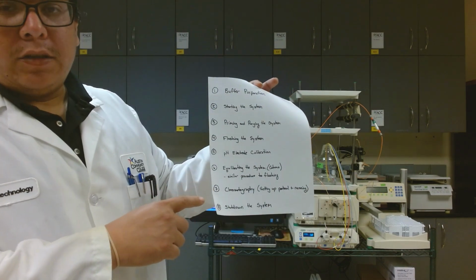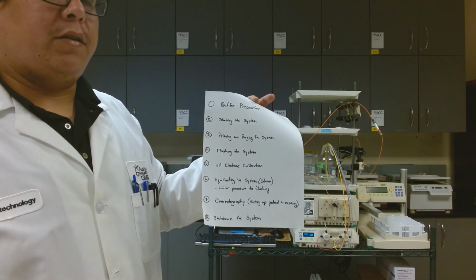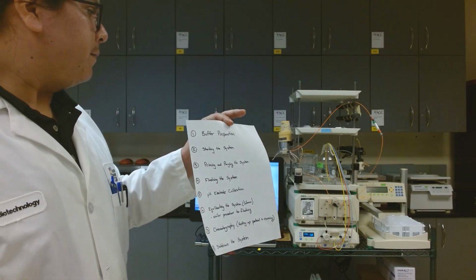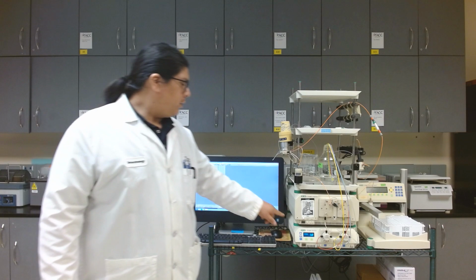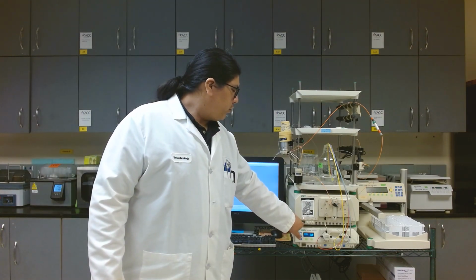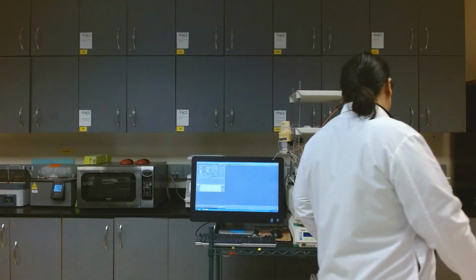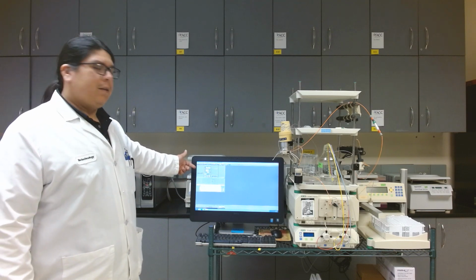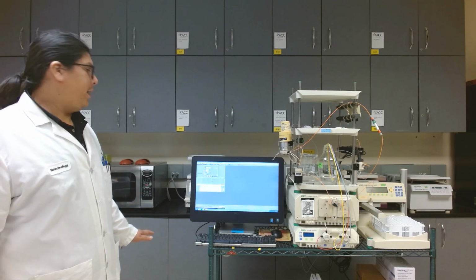We've set up a chromatography protocol. I showed you how to set up the protocol and begin the run, and then do some monitoring. And then at the end, we'll always want to remember to shut down our system. Once I've flushed the entire system with water, I'm going to flush it with 20% ethanol. What we'll do is just hit the hard switches on our pump, our maximizer, and then our fraction collector. And then the software will start to recognize that the different modules have been powered off or disconnected.